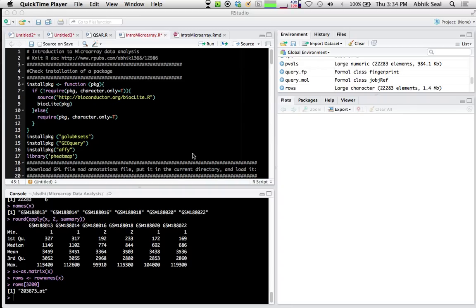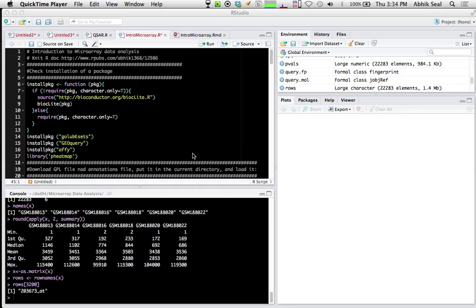The goal is to figure out which genes, when you give that drug, how the expression of other genes gets affected, or which other pathways or important transcription factors get activated.